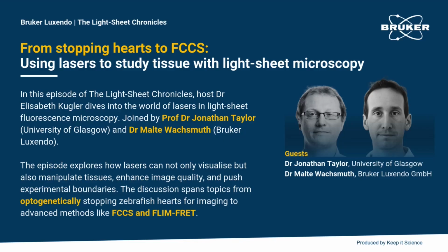And every molecule that enters your focal volume and leaves it again generates a kind of flash of fluorescence photons, and the length of these flashes or fluctuations represents, on average, the mean dwell time of your molecule inside your focal volume.